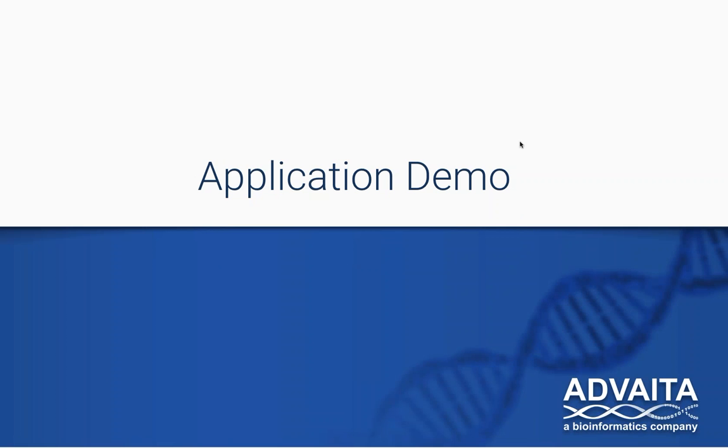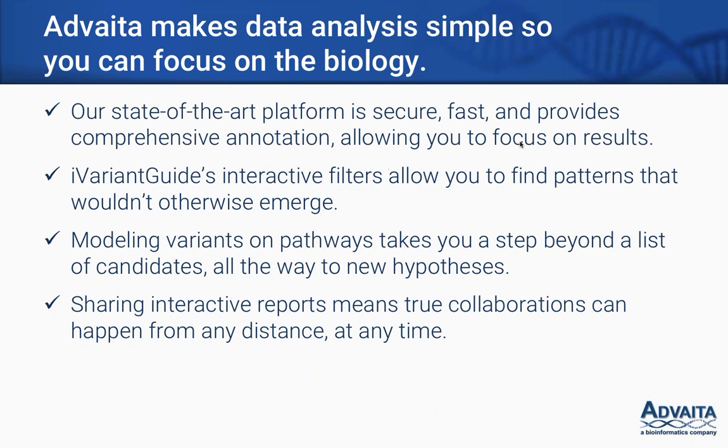Okay, I think that's it. I hope I convinced you today that iVariantGuide gives you powerful variant analysis in an easy-to-use package. Our cloud platform is secure and our annotation engine is fast, meaning you can do analysis anytime, anywhere. Our interactive filters make your data easy to navigate and help uncover hidden associations.